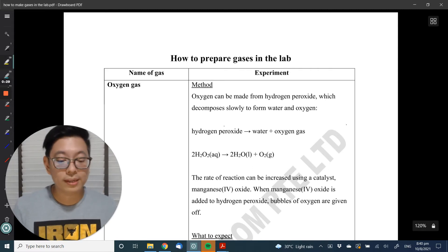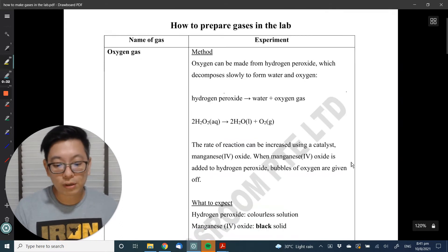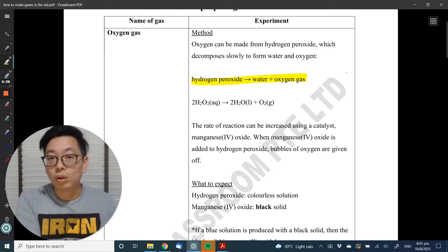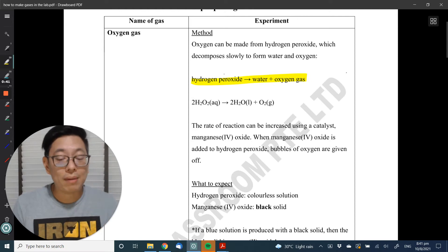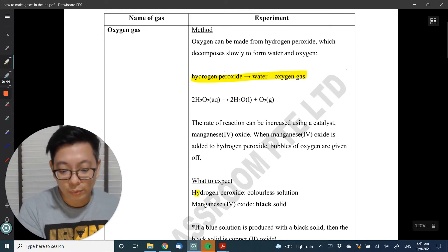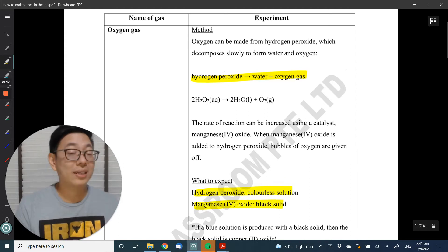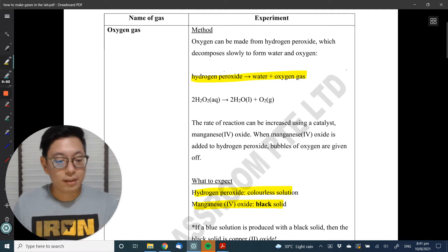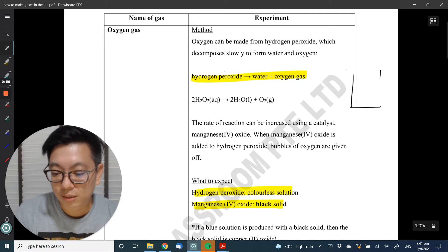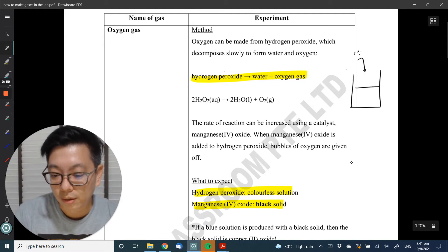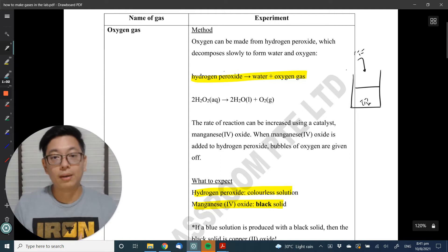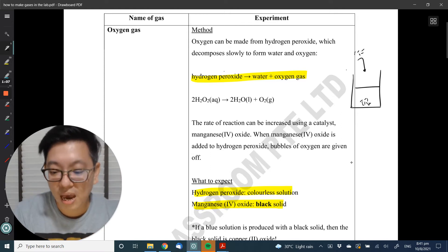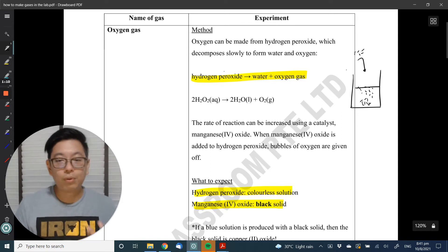The first gas is oxygen gas. To make oxygen gas, the chemical reaction is hydrogen peroxide breaking down — undergoing decomposition to form water and oxygen gas. In the chem lab, you'll be given hydrogen peroxide, which is a colourless solution, and manganese oxide, which is a catalyst and a black solid. If you're given a colourless solution and asked to add a black solid, the catalyst sinks to the bottom and immediately you see effervescence — I'll test for oxygen gas.